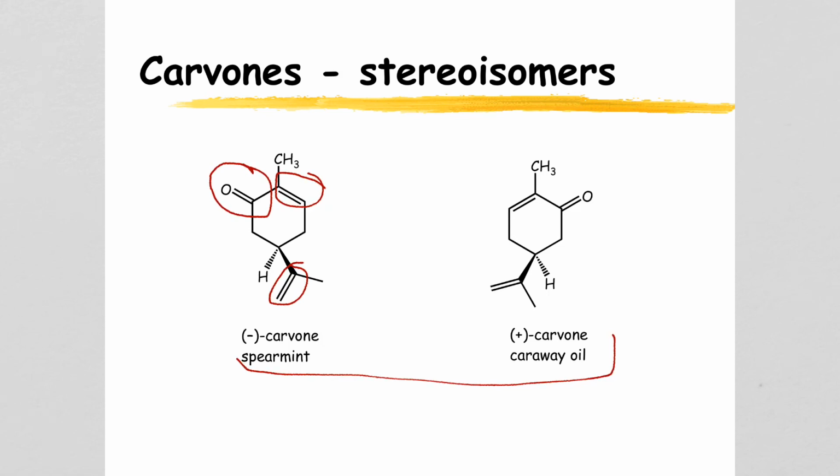In addition to looking at the two functional groups, the alkene and the carbonyl or ketone, one of the things we're going to also be doing is we'll be looking at the fingerprint region, because what you're going to do is you're going to overlay your spectrum with an authentic sample of carvone. So you'll be doing a comparative method, also using your spectroscopic methods.